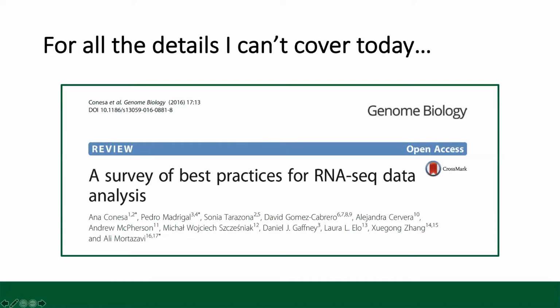I'm going to do my best to walk through the basics of RNA-seq, but obviously it's a huge topic and you would need days or weeks to really dive into it and fully go over everything. Since we have only a little over an hour today, I'm going to refer you to this paper so you can seek out more answers and get your details there.